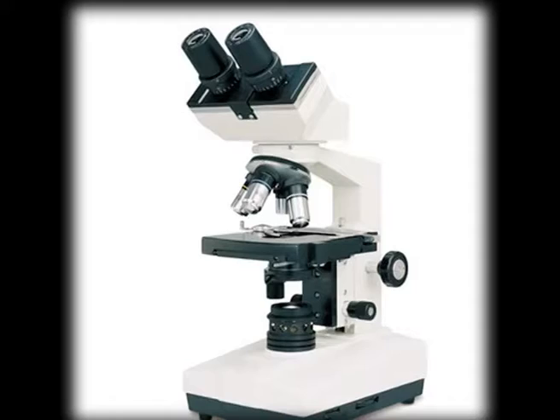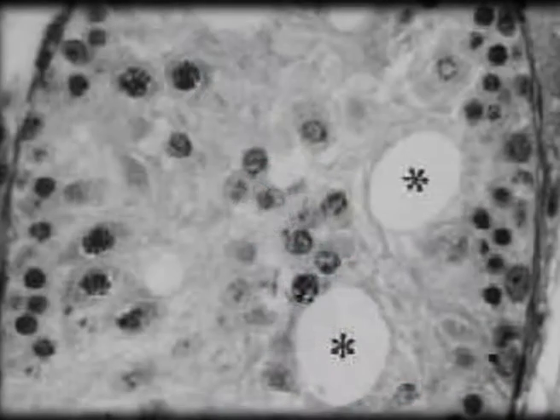Let's say if I want to see events at the surface of the cell, then if I just use a light microscope, the whole of the cell is lit up. If I use a microscope or a lens where I create the condition of total internal reflection, then only a part of the whole cell which is near the plasma membrane will get lit up. I will come to the details in a later section of this lecture.